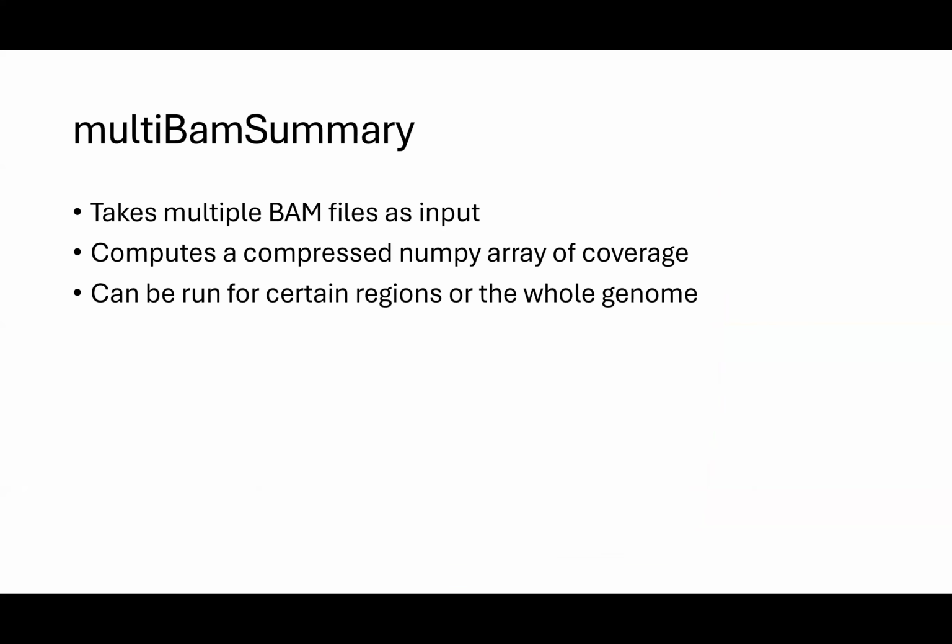The next tool from deepTools that you'll need to use is called multiBamSummary. It takes in multiple BAM files as input, and it makes this sort of coverage in what's called a compressed NumPy array.